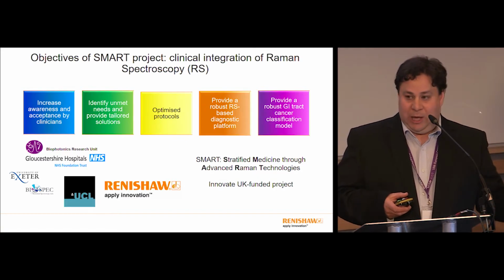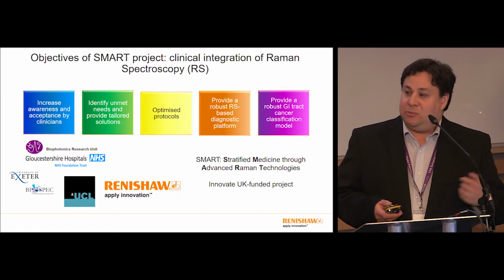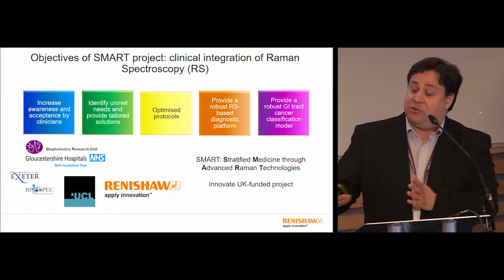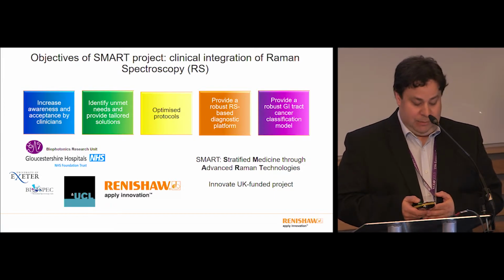One of the big principles of this project was data transferability. A lot of the case studies and projects that have been done in Raman spectroscopy have been single, small data sets, and there's been a real problem in translating this to the clinic. So we wanted to tackle the multi-site data transferability problem in this project.